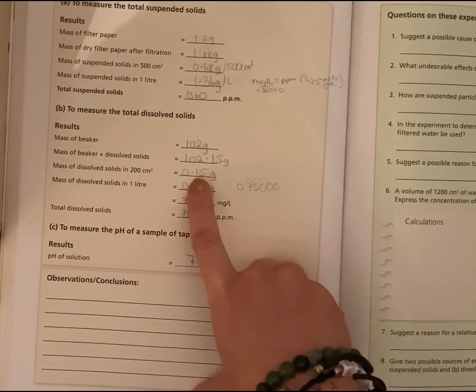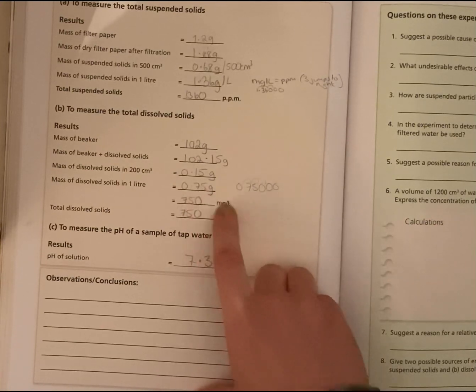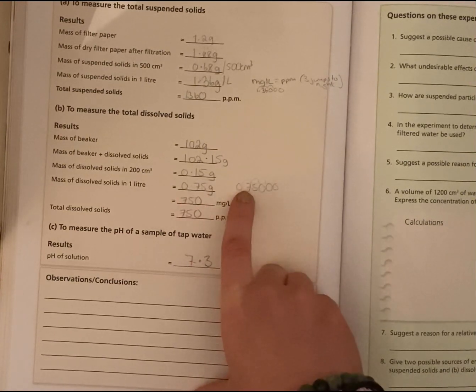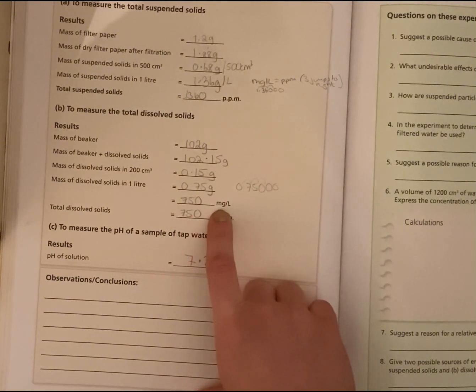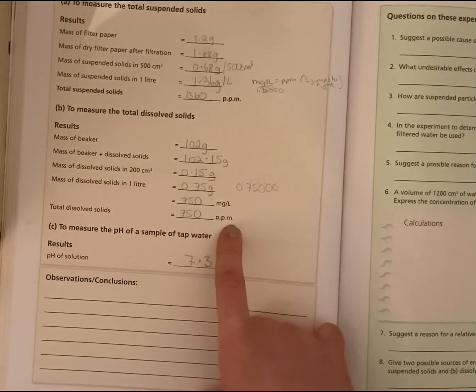So I'm going to multiply this number, whatever your number is, by 5 to get it up to how many grams would be in a litre. So that would mean the next section is going to be milligrams per litre. So again, you move it 3 spaces to the right. So 1, 2, 3. That'll be 750 milligrams per litre, 750 parts per million.